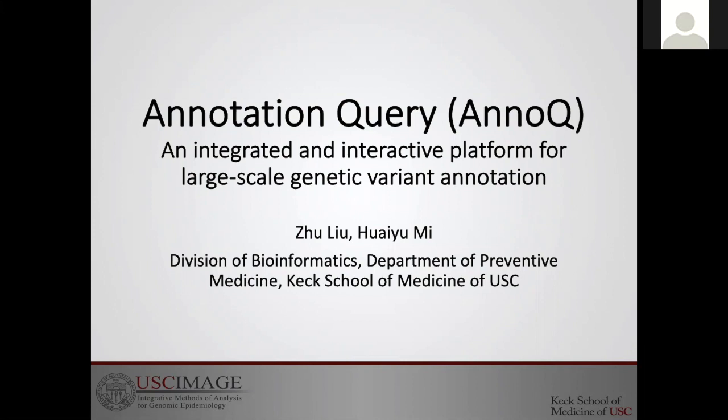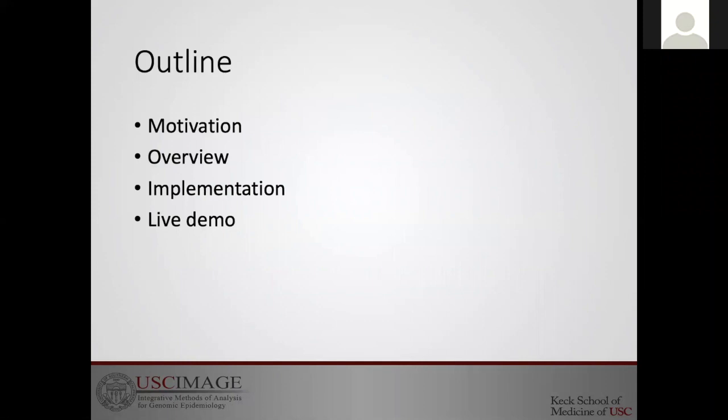In this Happy Scientist seminar, Zhu and I will introduce you to Annotation Query, which is an integrated and interactive platform for large-scale genetic variant annotation. I'll first tell you our motivation behind building this tool. Then I'll give you an overview focusing on the difference between this tool and other tools out there. Zhu will tell you more about the implementation and give you a live demo.